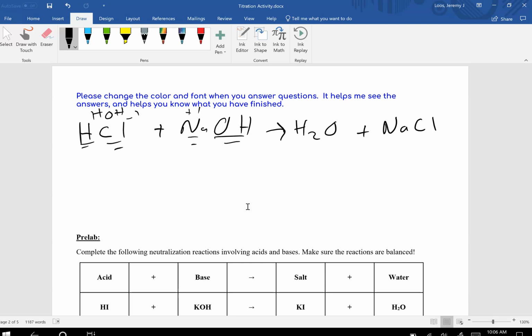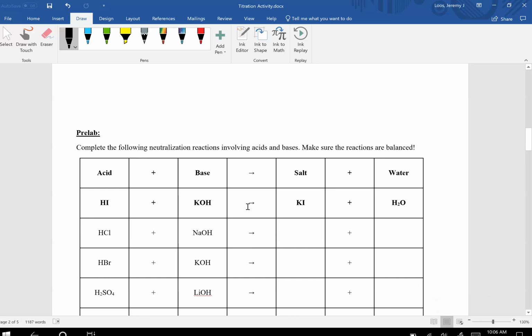It's balanced and everything. So in here, you would type in, now I can write it in, since I happen to have a pen, but you can type it in, NaCl and water. This last one's always going to be water. So you got that going for you. And then, yeah, NaCl is salt, what we classically call table salt.